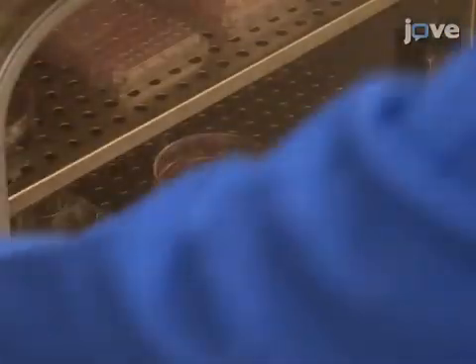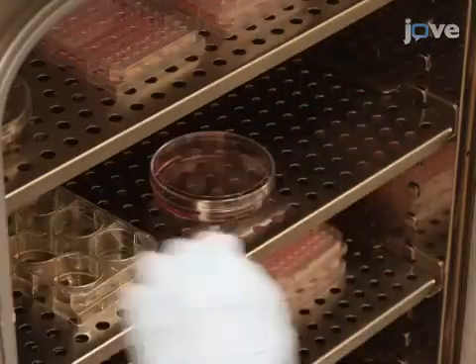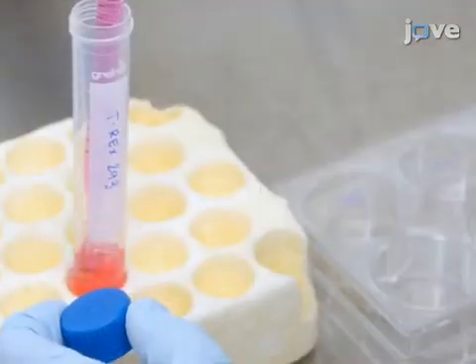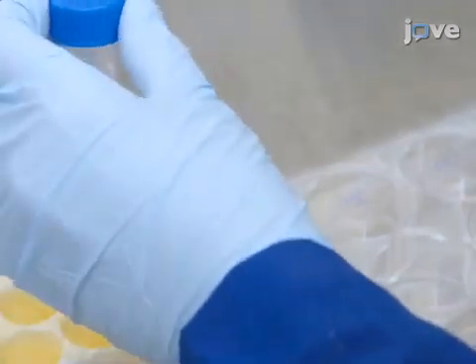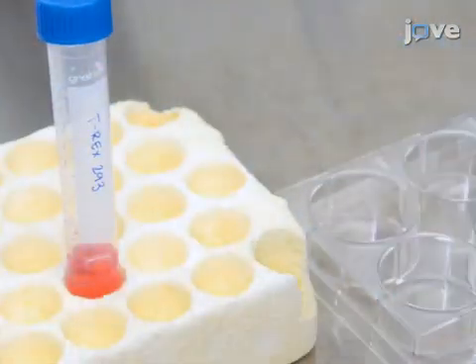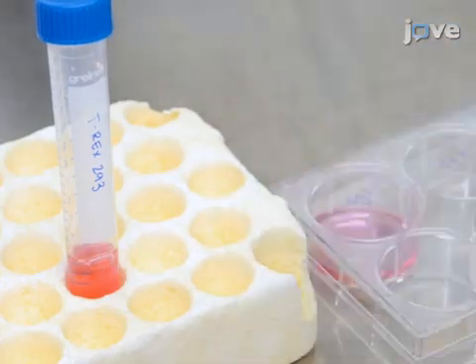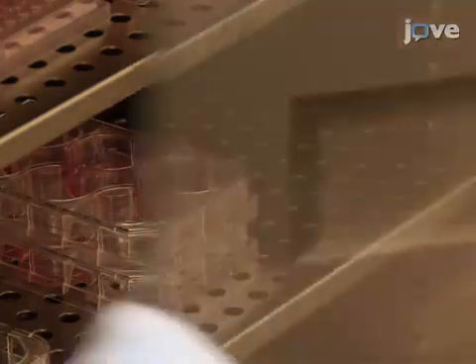This experiment uses T.rex-293 cells cultured in DMEM media supplemented with 10% FBS at 37 degrees Celsius and 5% carbon dioxide. Prior to transfection, plate the cells onto six-well plates and include a well for an untransfected control. Grow the cells to approximately 70% confluency.